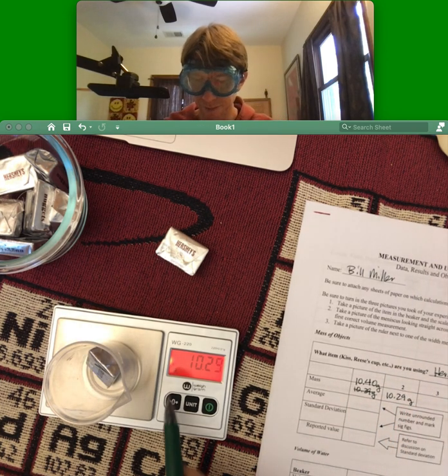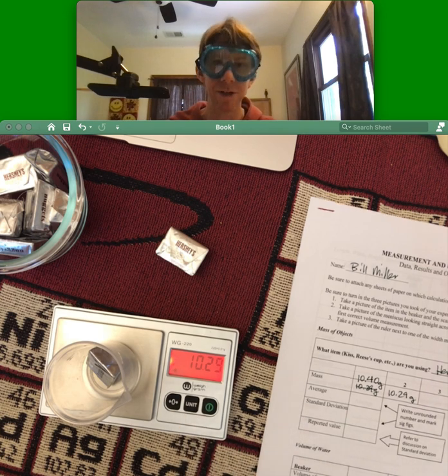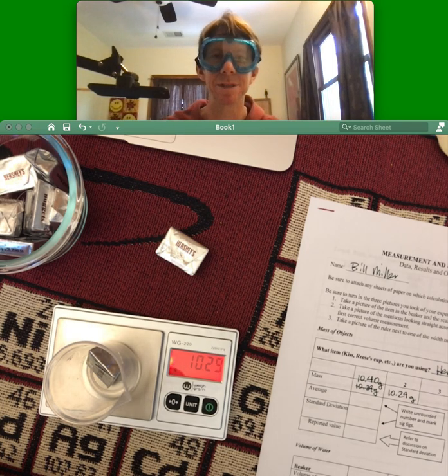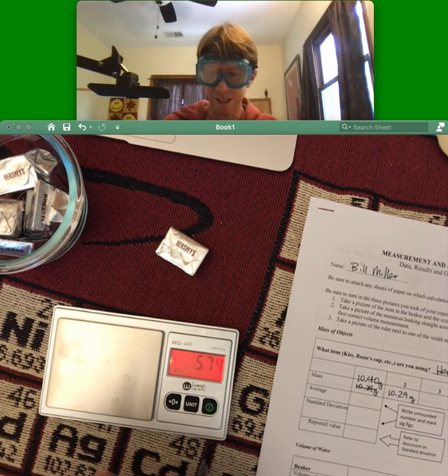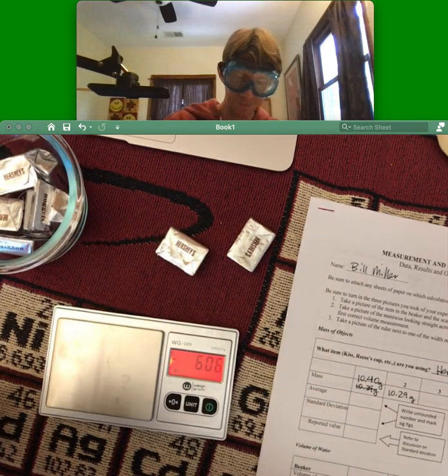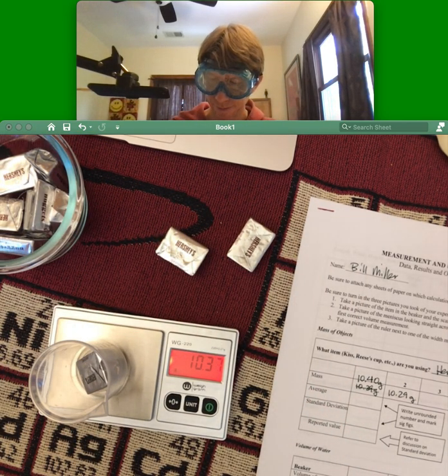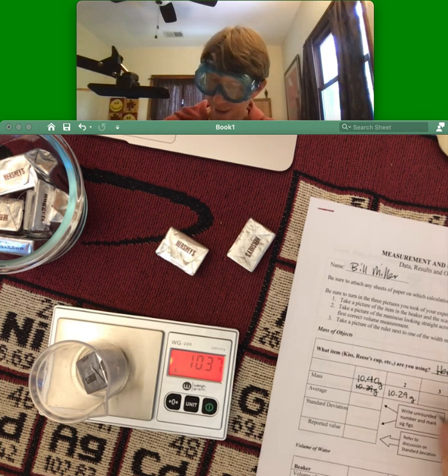Make sure you've got your units. And make sure you're on the grams unit because you can be on other things, and you want to make sure whatever you do that you've got the right units. You do want to record it in grams since gram is mass, and that's what we measure in chemistry and science. This one's 10.37.